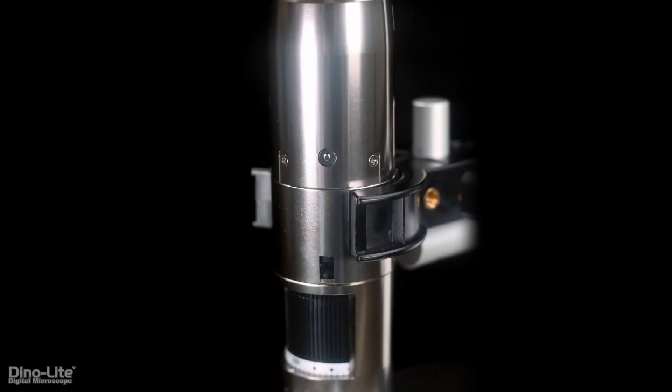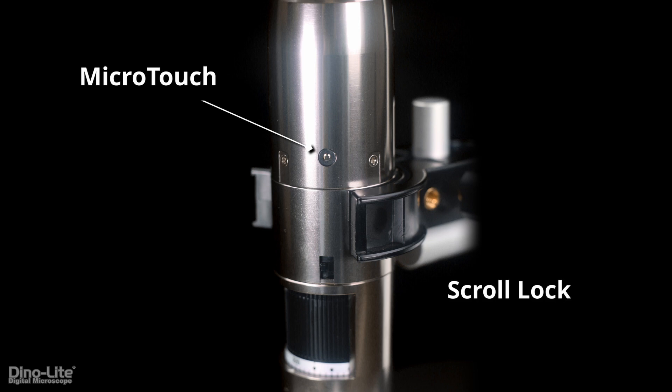Your new 8MP scope also comes equipped with a micro touch sensor for easy photo capture with just a touch, and a scroll lock to prevent unintentional magnification changes.